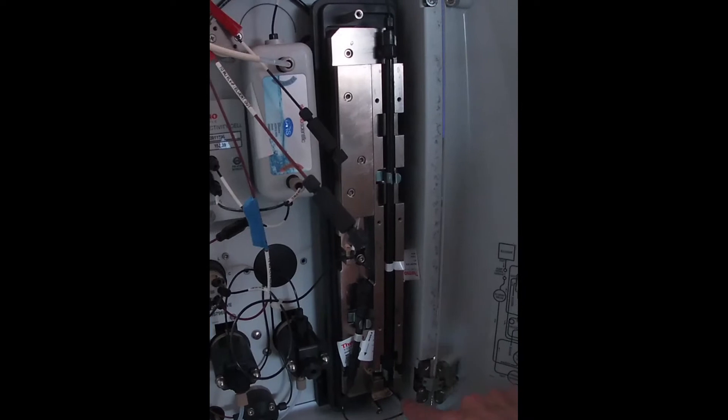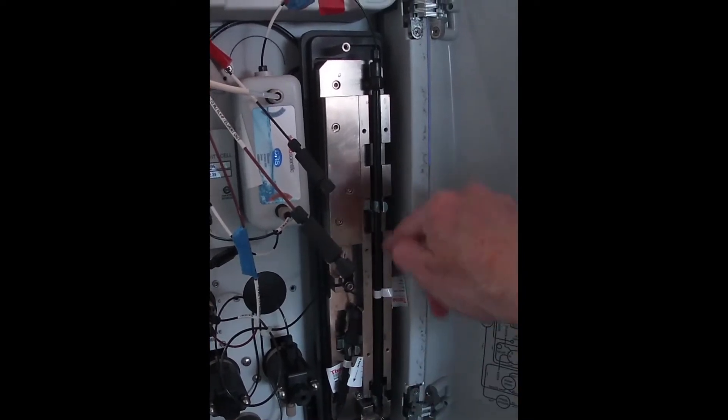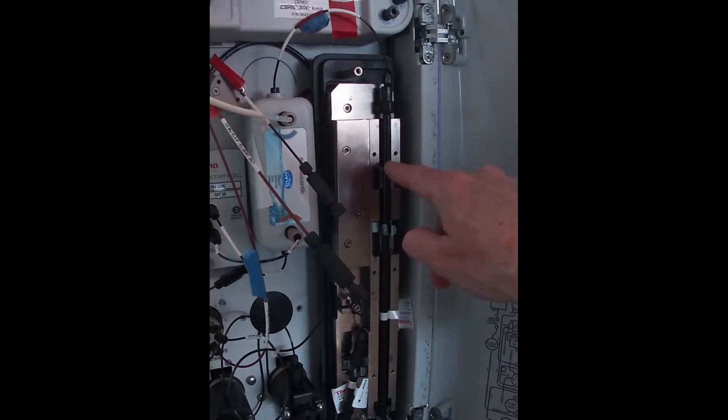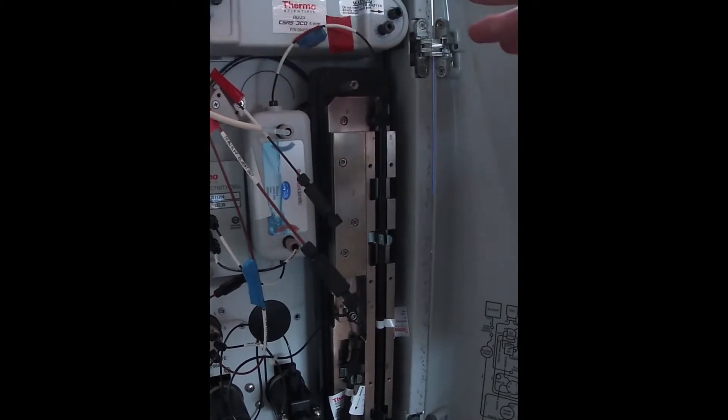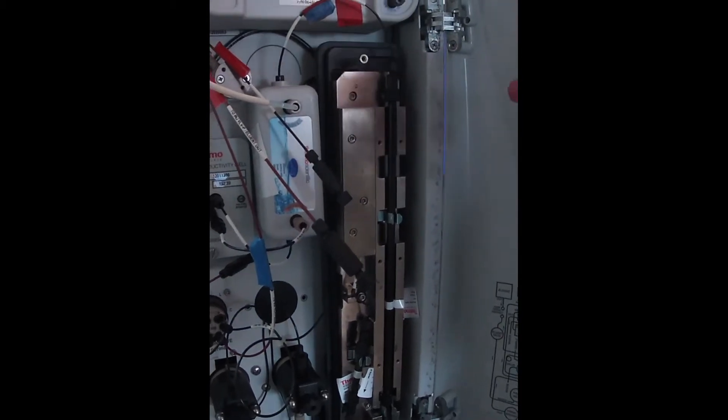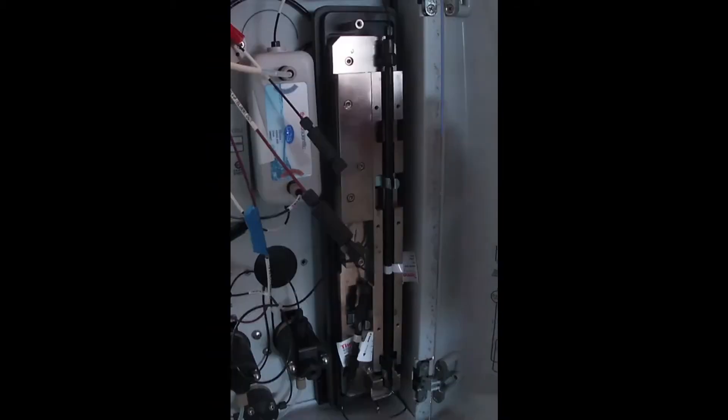So then it flows through here, goes through our analytical column where all the separation occurs. Separation predominantly being by charge magnitude but also affected by ion radius.